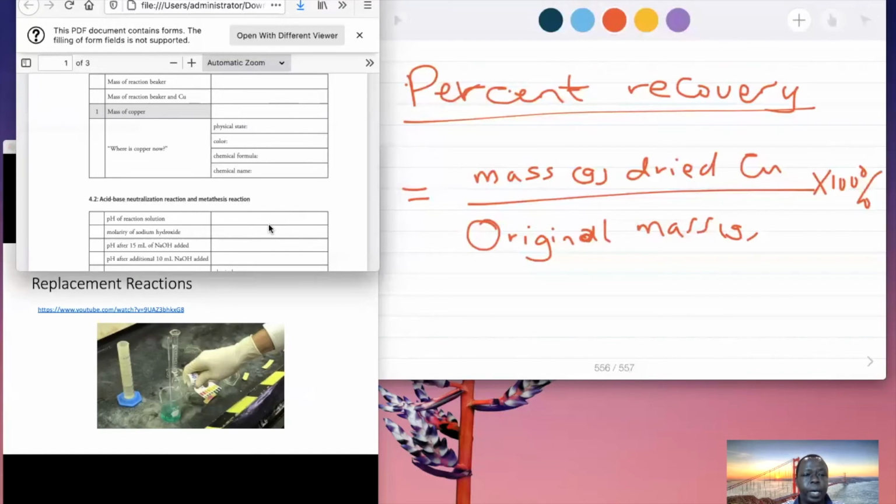Please indicate that. Molarity of sodium hydroxide, it should be in the background procedure, please. It is not given in there, but you will read the background procedure for the information on the molarity or concentration of sodium hydroxide. The instructor will do the demonstration for the pH of 15 ml.